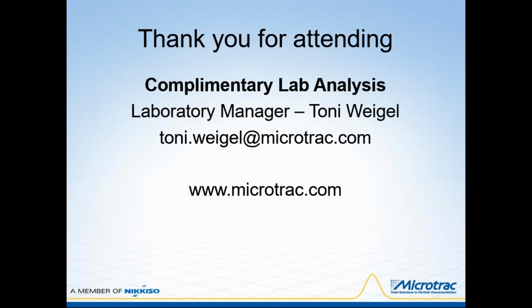Great, thank you. So someone else is asking, how many particles can be analyzed in 10 minutes? It depends on the concentration of the sample. You can feed the material at various rates, and it certainly depends on the size distribution of the particles. We've measured some fine samples into the millions in less than 5 minutes.